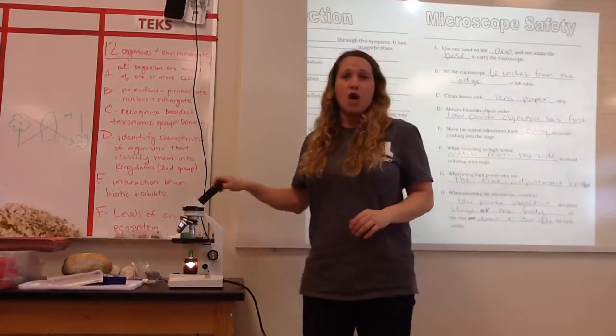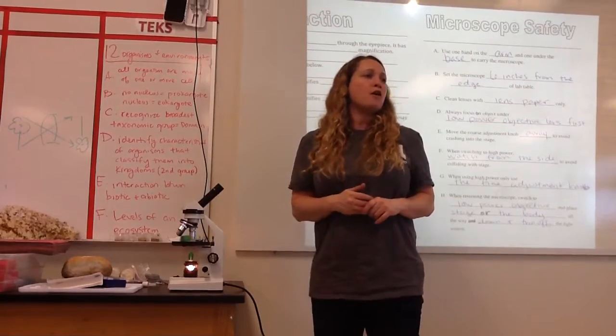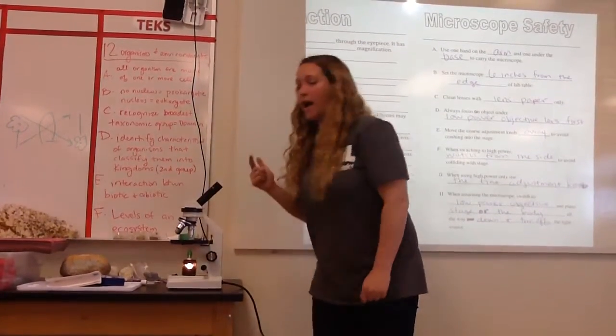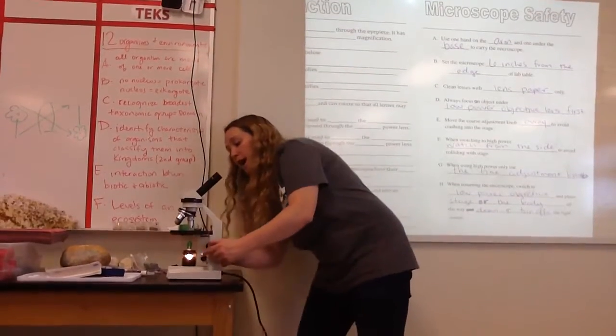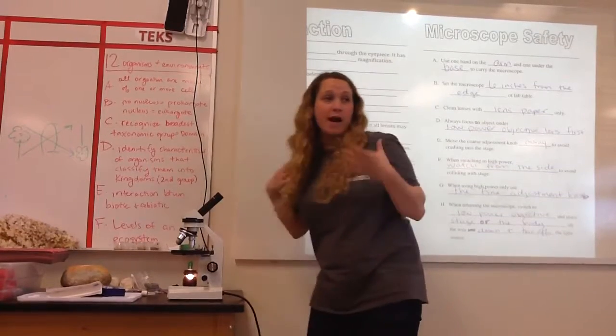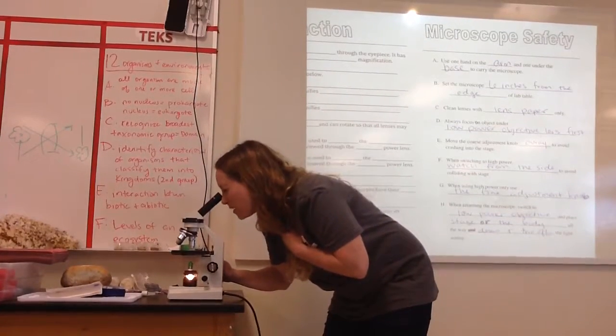I can see it. I can draw it. I can take observations. However, what if I backed up and I never could find it? Then I'll need to take my eye away, look from the side, and move the stage all the way up again. Okay, now it's up all the way. Now I can put my eye back on and start backing up again till I see it.